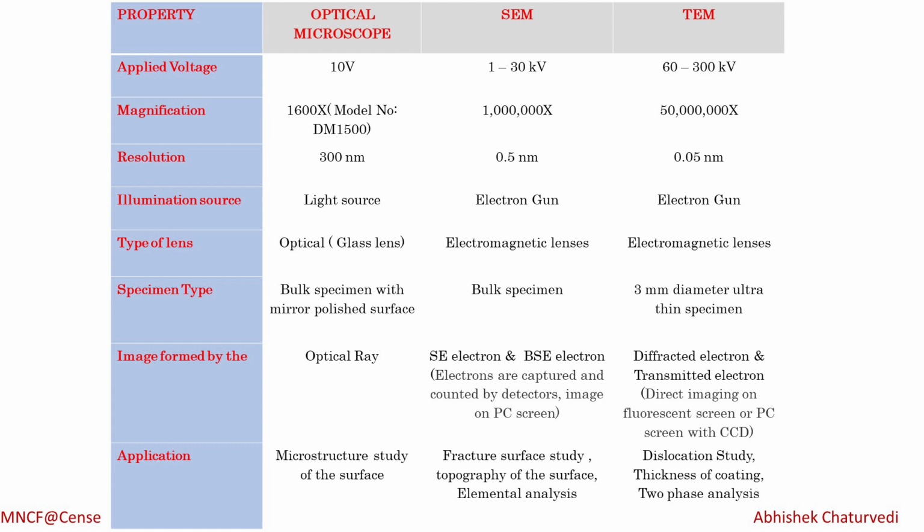Resolution, this is a very important parameter, viewers. We should always take resolution into consideration. In an optical microscope we have 300 nanometer resolution. In SEM, under best conditions, we can go up to 0.5 nanometer.